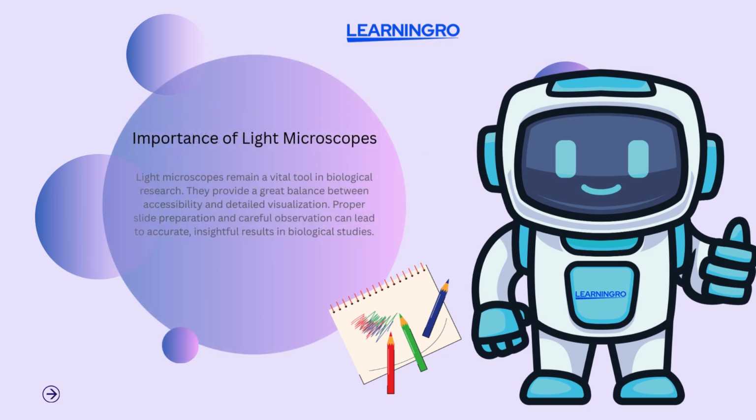7. Importance of light microscopes. Light microscopes provide a valuable tool for biological research, offering a balance between accessibility and detailed visualization. Preparing samples correctly ensures accurate observations.